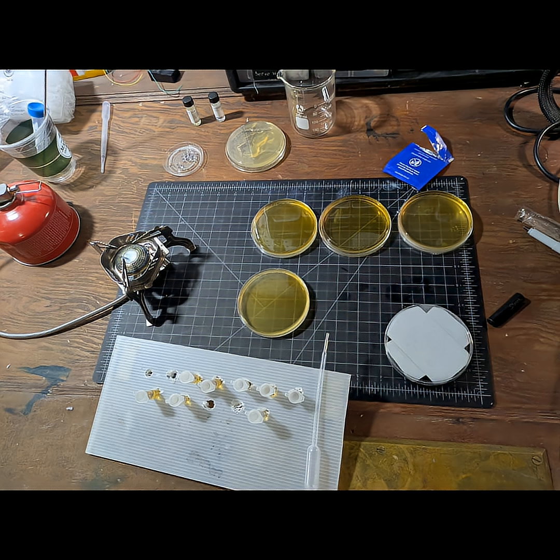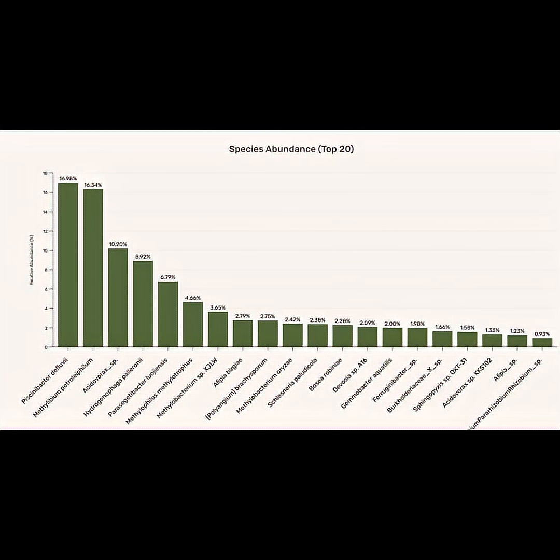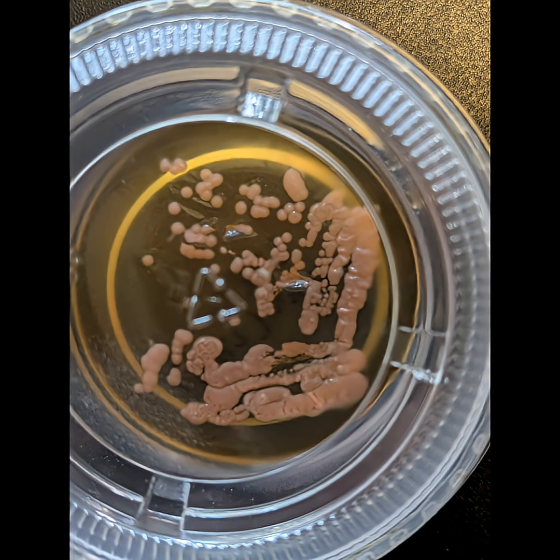One way to do this is to make up some plates of tasty agar and grow some random microbes from your environment. I had these goopy blobs floating in a jar, and I'd already had a sample sequenced to see what bacteria were living in there. After swabbing one over a plate, I got all sorts of stuff growing, including this lovely pink yeast, which I was able to isolate.